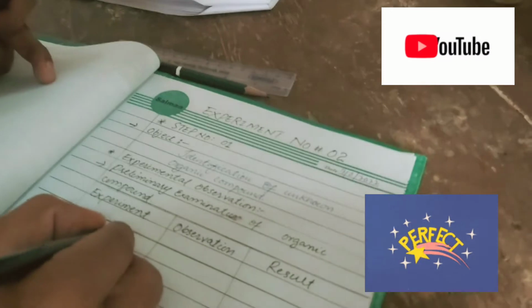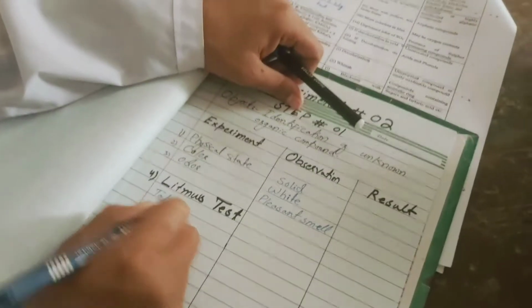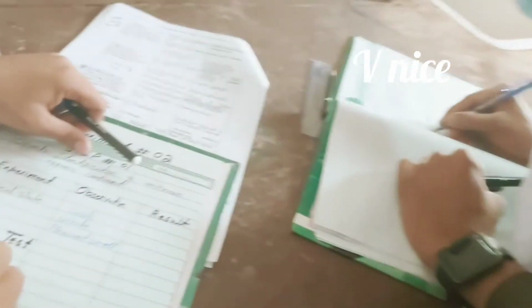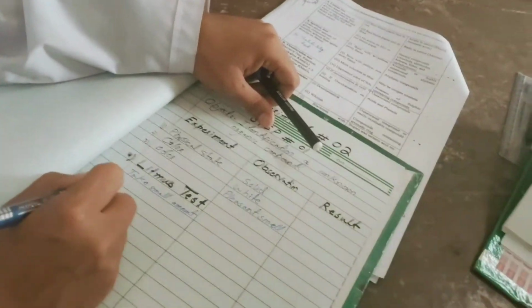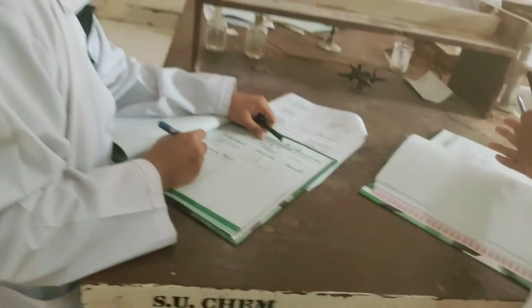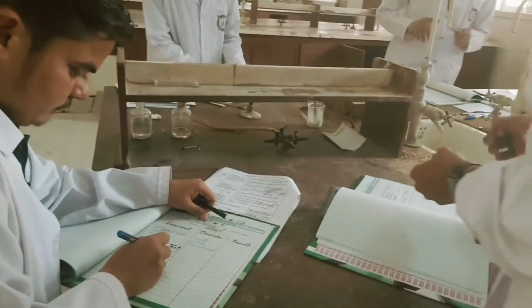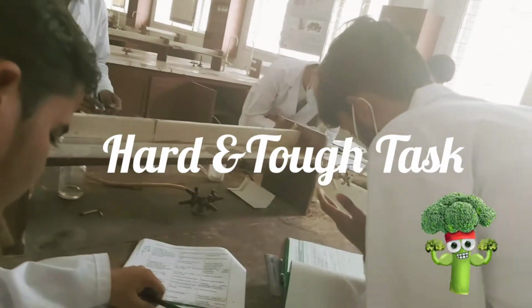That's great. This is experiment number 2. Step number 1, an unknown compound. This time an unknown compound has been given to them. This is how they are writing the test. I'm showing every minute detail to let my students learn how to make a journal, how to make these columns, and how to perform these small preliminary tests, because this is the first step they are doing right now, and they are supposed to finish two steps in this turn. Step number 1 is preliminary examination, and number 2 is detection of elements.